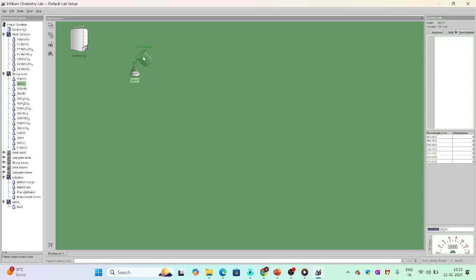So now it will give you this kind of orientation, and on the bottom side there is a transfer amount written in ml. Now if you type say 12 ml and press enter, you can see there is something which is filled up here. Now similarly, just drag and drop, take it away, and it will become normal.